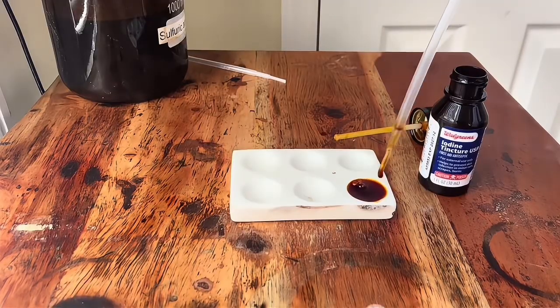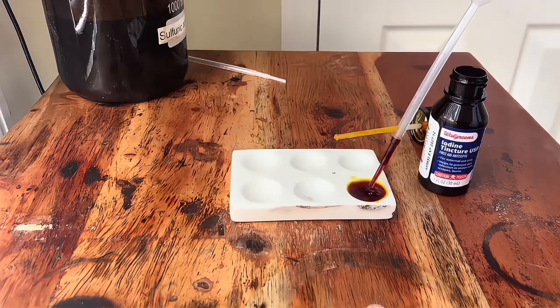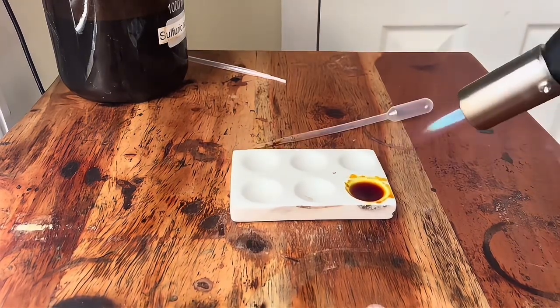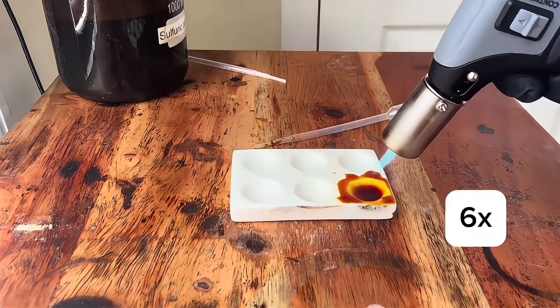I added a little bit too much, so I'm gonna suck it up with a pipette and put it back into the container. Next, I'll use a butane torch to evaporate the ethanol and water.